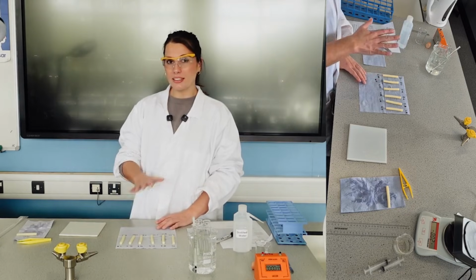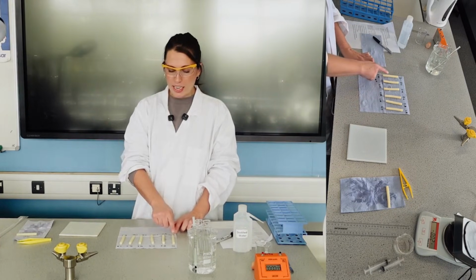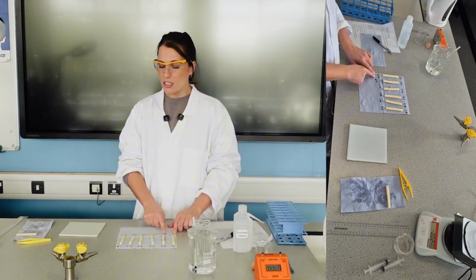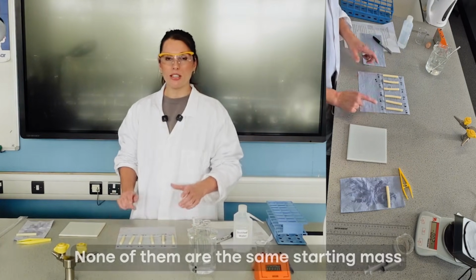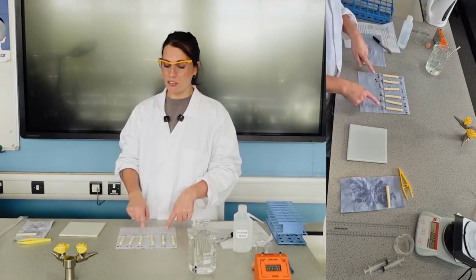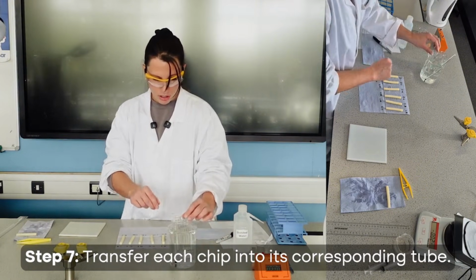And we're going to do it as a percentage change in mass because we can see here, these are our starting masses. And even though we've used the same potato, same cork borer, cut them to the same lengths, none of them are the same starting mass. So that's why we'll do it as a percentage change in mass to take into account none of them started off the same. So now I have to be really careful. I definitely put them into the correct tubes.